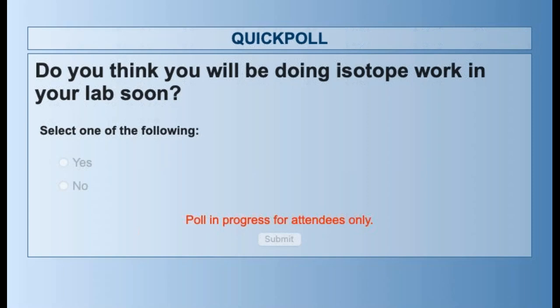One more thing I will say about isotope ratios is, what kind of precision do you need? There are three different types of isotope ratios that we look at. Radiogenic isotopic ratios: in the geologic world, strontium is really, really important, and we need 5 decimal place precision to really be able to tell differences between certain rocks. We're never going to get that on a quad. It's just not happening.